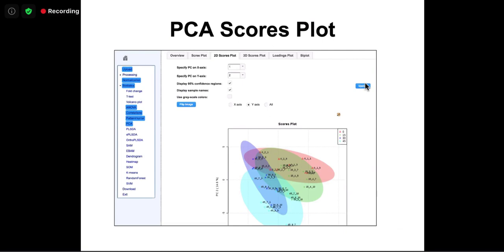I also received suggestions, which I'd have done before, but it's not available: the stability of the PCA scores. Sometimes the PCA separation is driven by one or two strongly influential samples. One way to do this is cross-validation. Basically, you leave out one sample at a time and recalculate PCA, many times, everything cross-validated, so you can see the position change for each sample. You draw squiggle lines for all the possible positions of each sample with regard to their center. I found that meaningful. You want to see whether the position is stable or not. If you remove one or two samples and suddenly all the separation is gone, then it is not so confident.